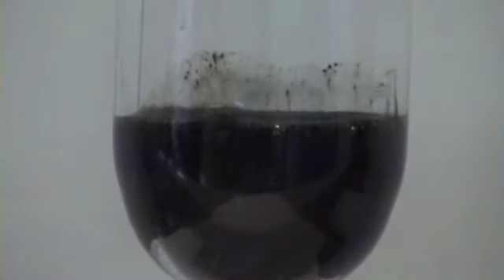What we've got is manganese dioxide, manganese 4 oxide. It's called manganese 4 because that's its oxidation state, plus 4. I'm going to put into that some concentrated hydrochloric acid, and you'll see, hopefully, some reaction going on there.